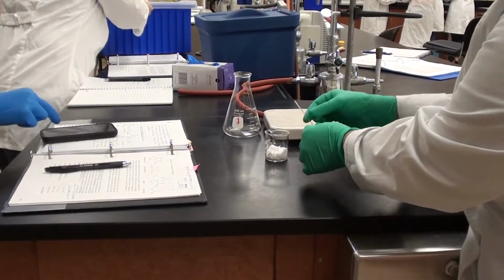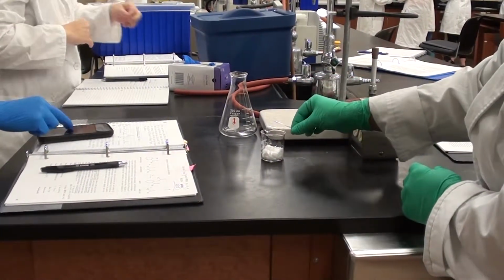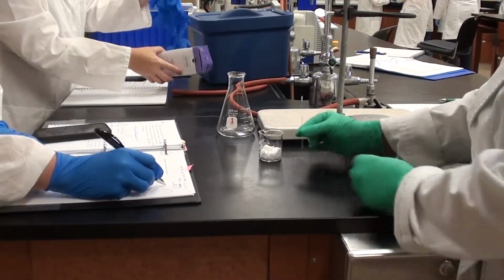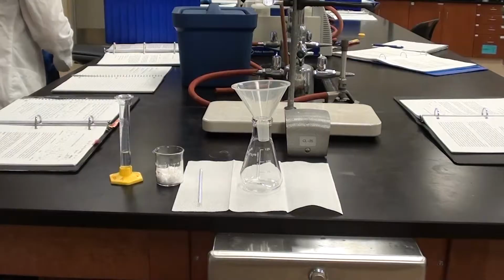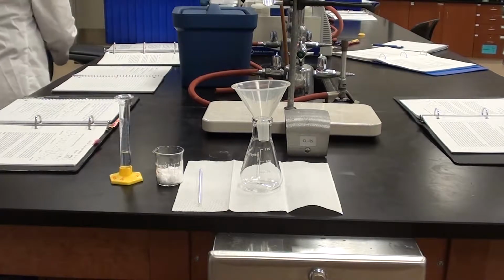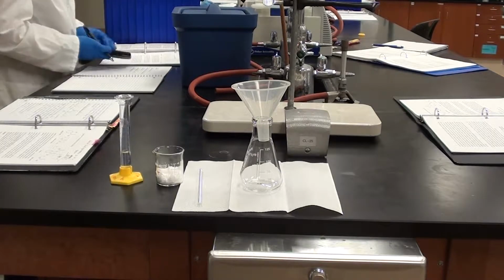So Tina's getting a sample here of the salicylic acid for a melting point, and she's going to make sure she does that before it gets used in the reaction. So this is the beginning of part 2, and we're going to turn this salicylic acid into aspirin.